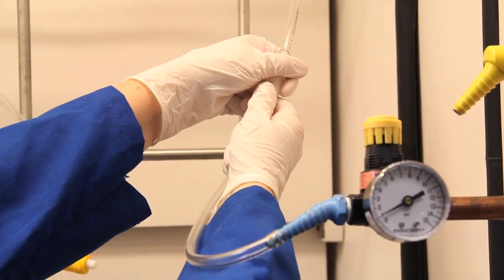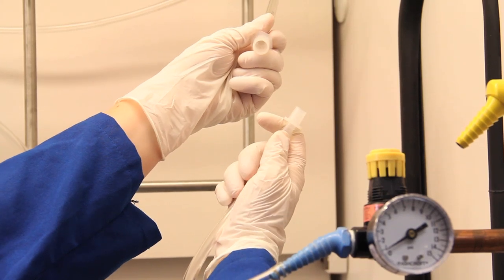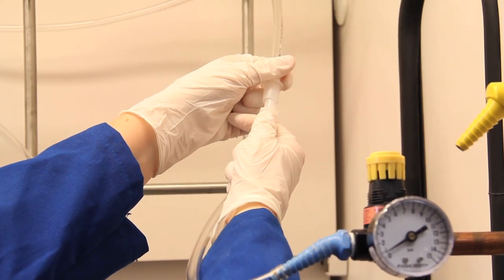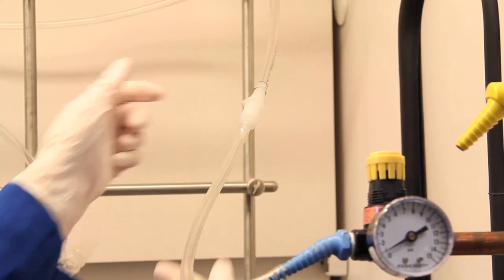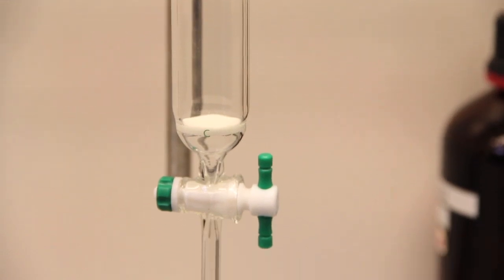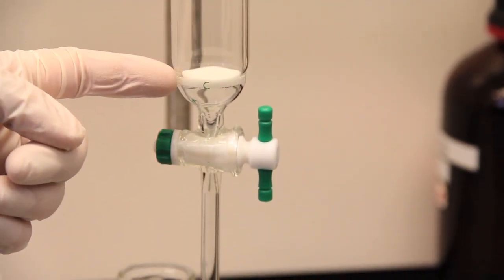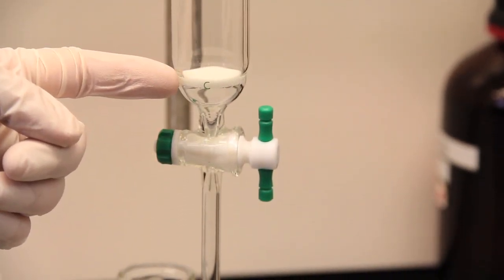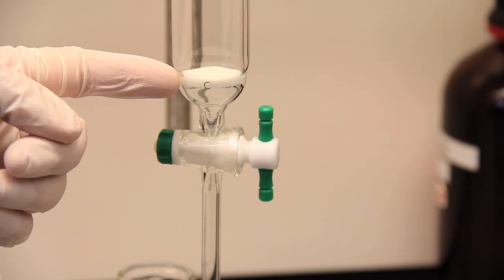For extra precaution, I added this connector to the tube. It serves as a weak point so if too much pressure develops in the column, the connector will pop. This column has a glass frit, but other columns may not have it. In that case, you need to use cotton or glass wool to plug the bottom and then pour some sand over it.